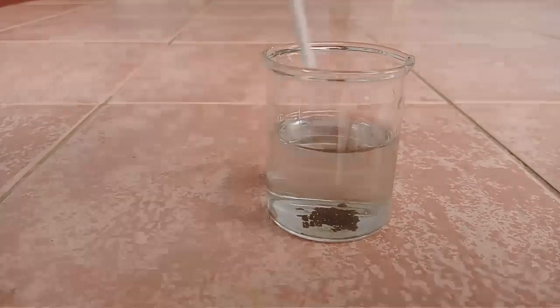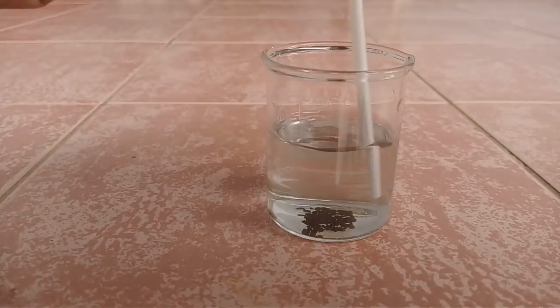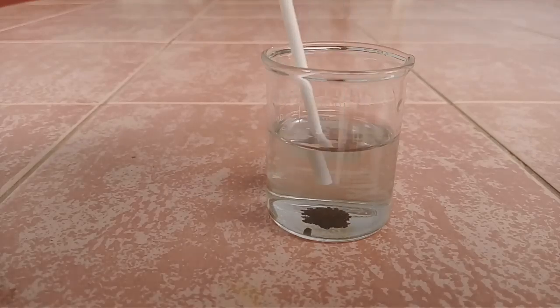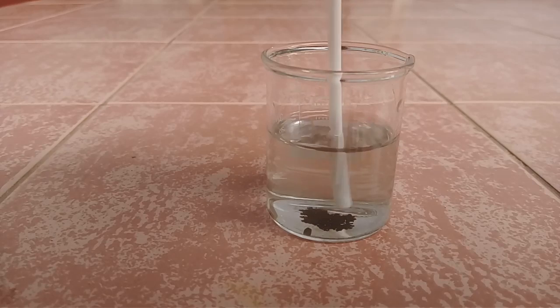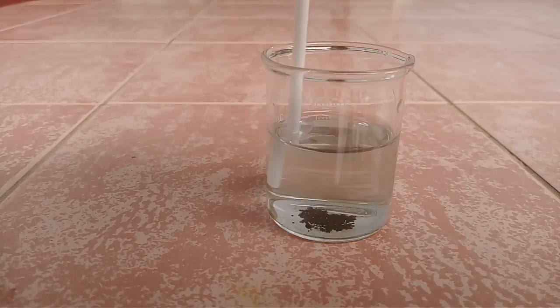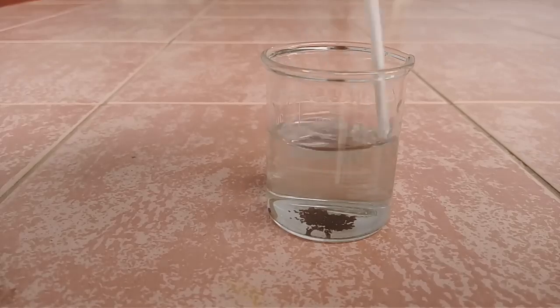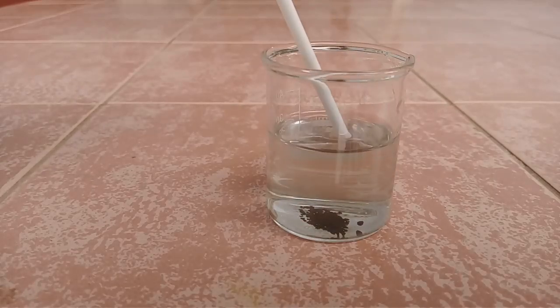Now you can see here the gold has precipitated out. The reaction is mostly complete. So this black precipitate is our gold. Now you can see here the solution is light blue color.